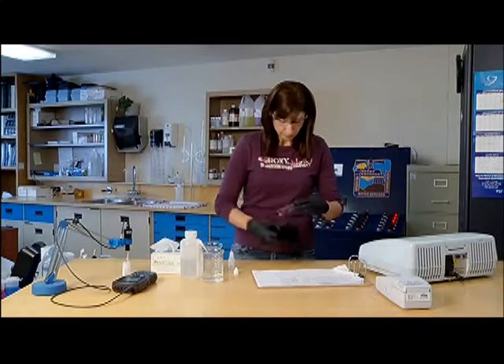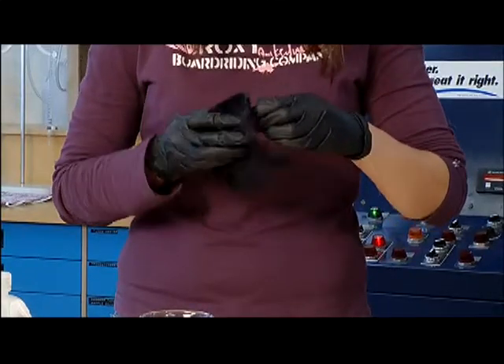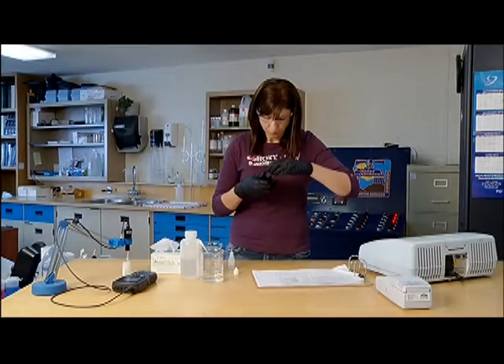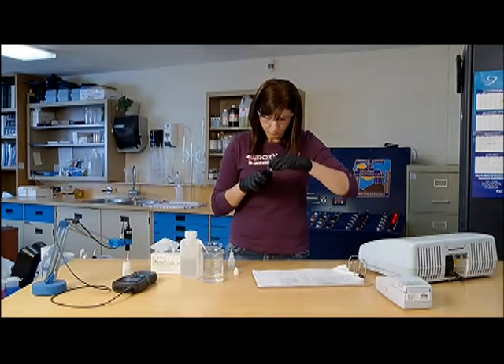Use silicone solution and the manufacturer-approved wipe cloth to clear any scratches from the vial. This is done to reduce interference with the light beam from the instrument passing through the vial during the test.